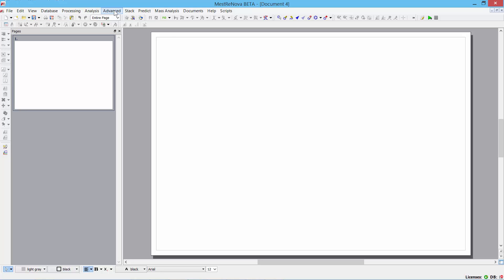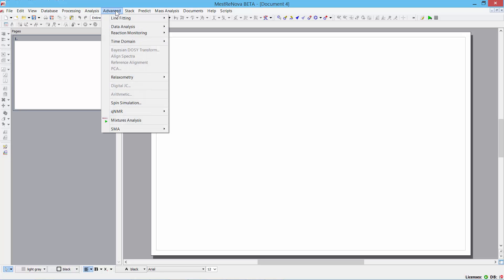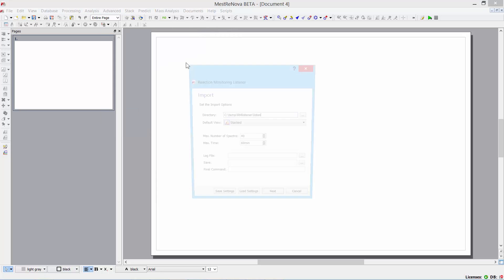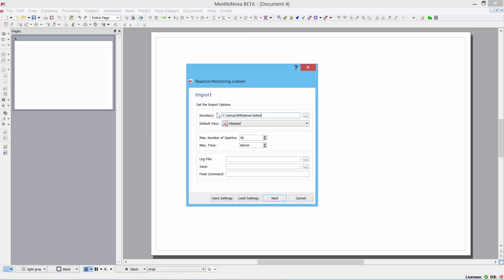So here we go. This is the way it works. We go to Advanced, Reaction Monitoring, and Listener. I tell it which particular directory I'd like it to look at. And this is the directory where the data will be copied as they appear.